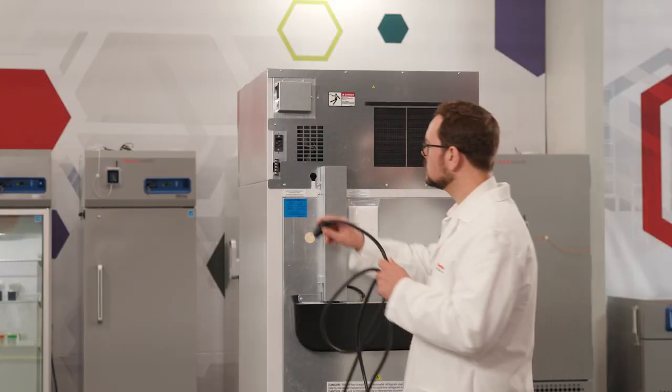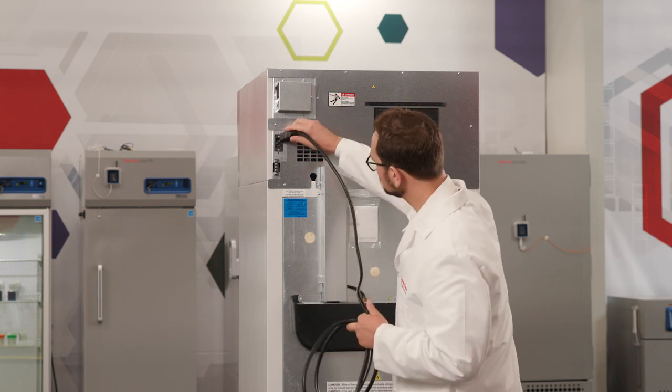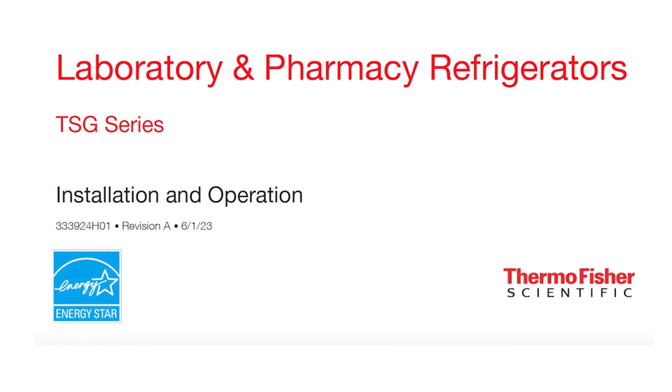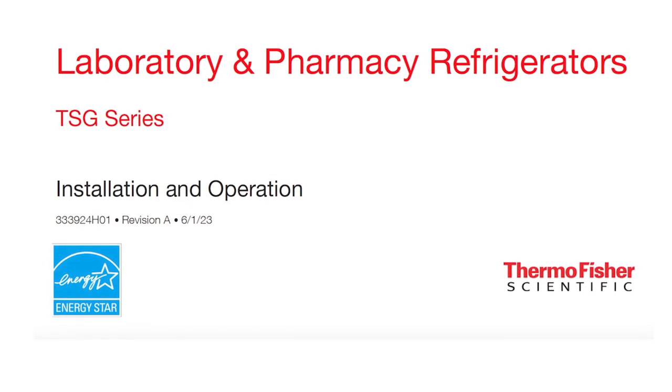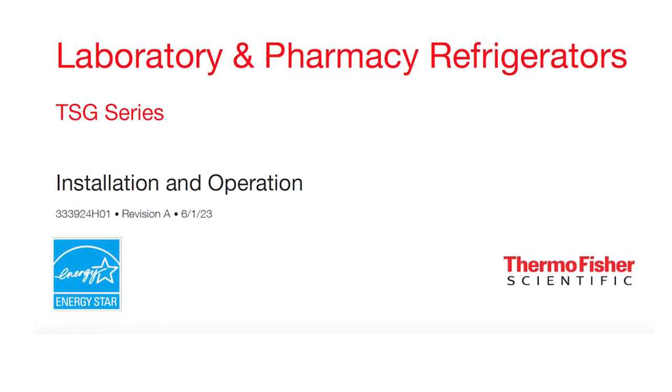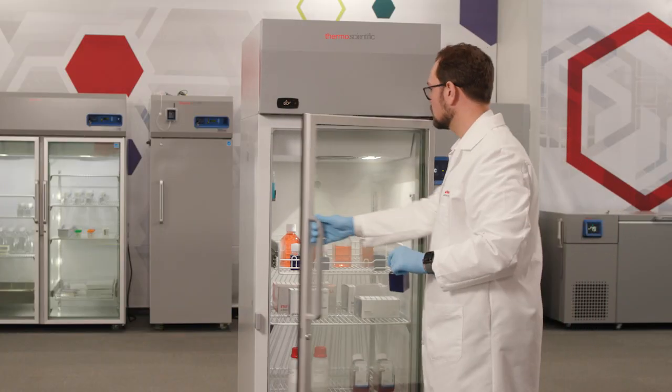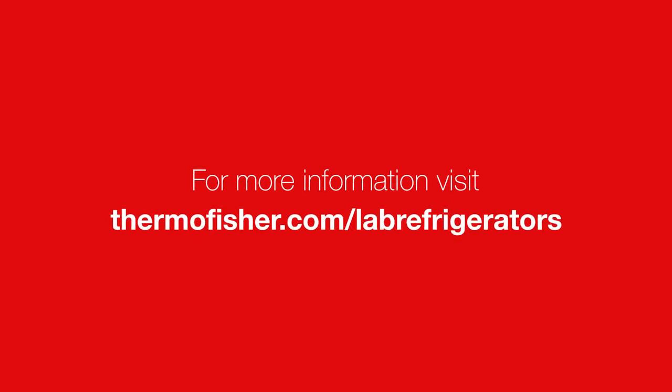View the Thermo Scientific TSG series refrigerator initial startup video for instructions on starting your unit. Additionally, refer to the Thermo Scientific TSG installation and operation manual for more information. Enjoy your new Thermo Scientific TSG refrigerator and visit thermofisher.com/lab-refrigerators for more information.